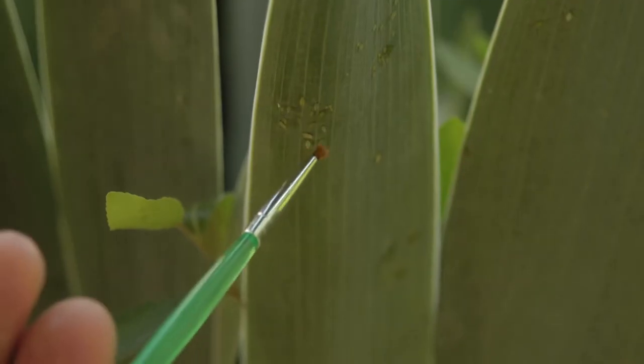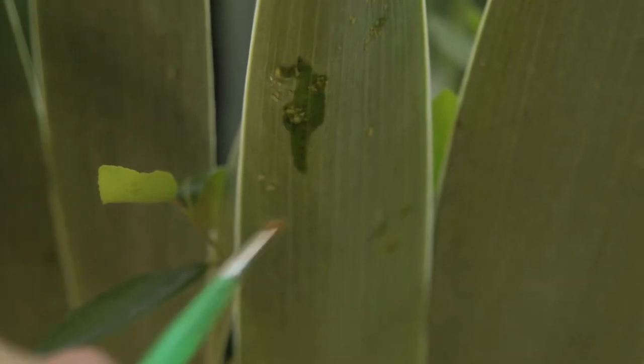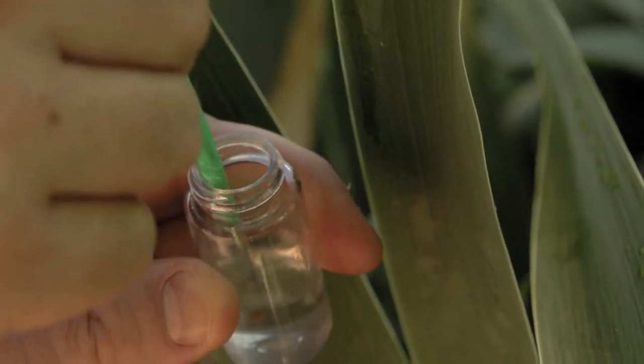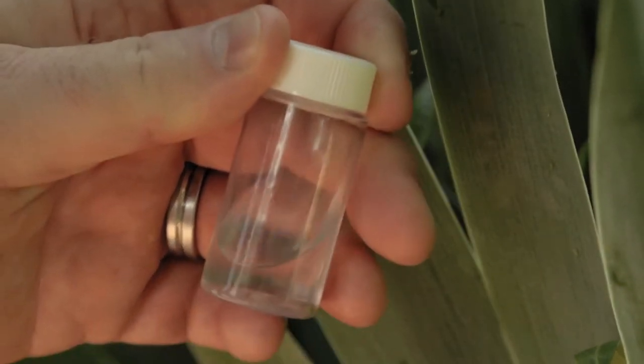To get the insects into the alcohol, you can use forceps or tweezers or you can grab a paintbrush, dip it in the alcohol, dab the insects, killing them, and then scoop them up with the paintbrush and swirl them around in the alcohol container.